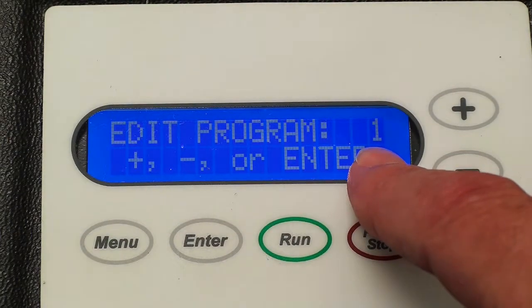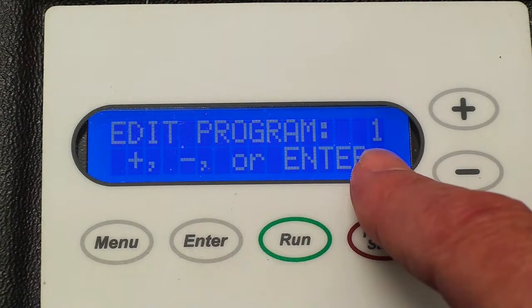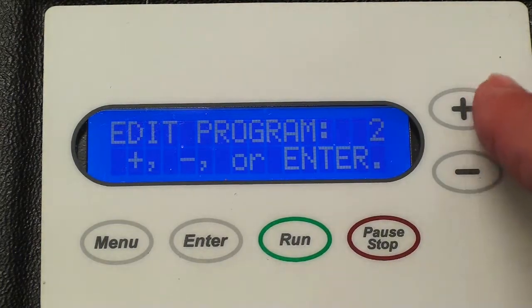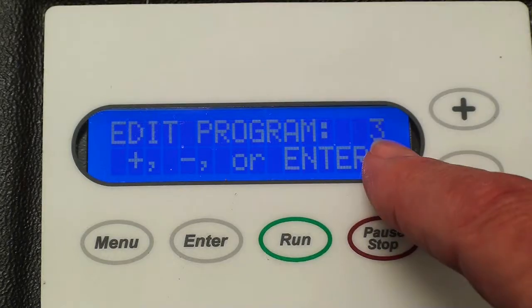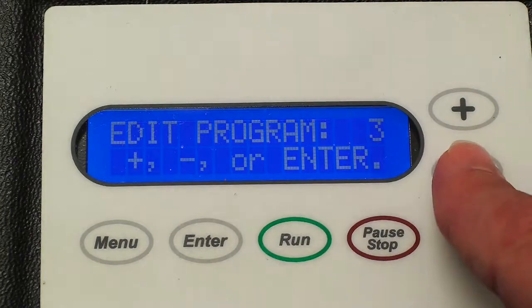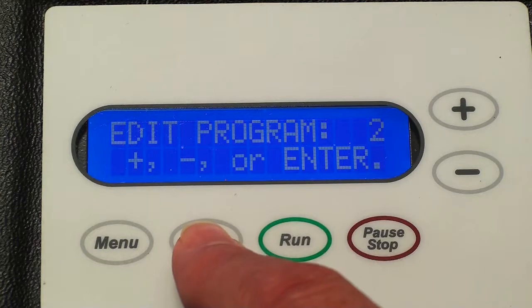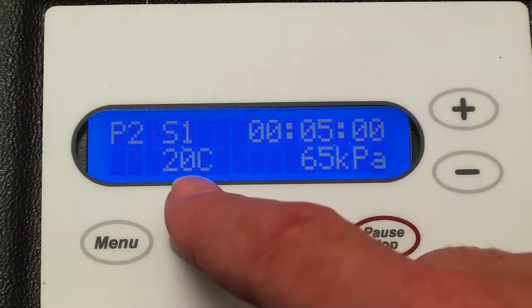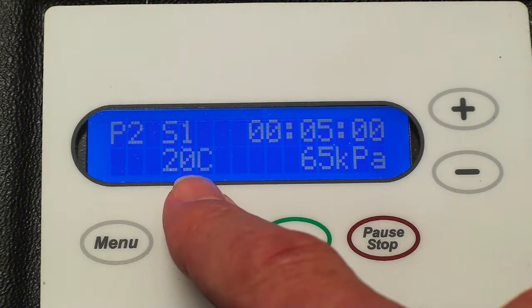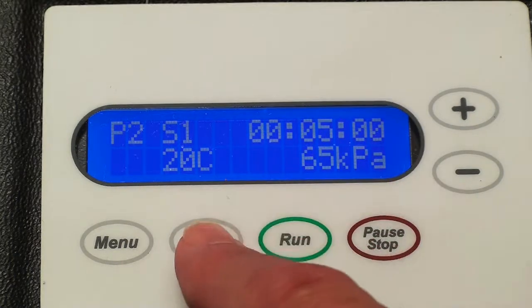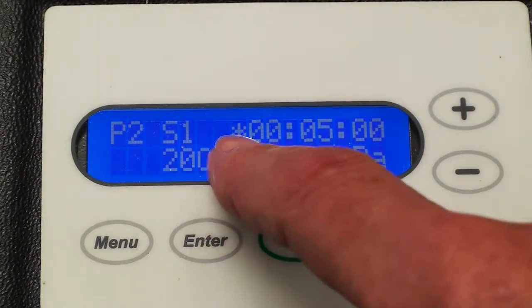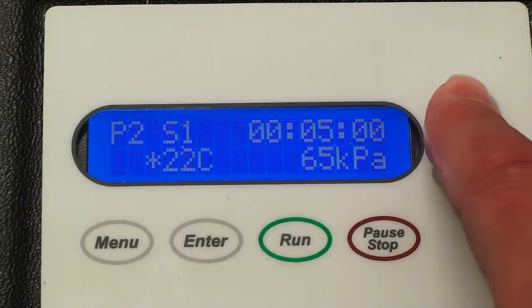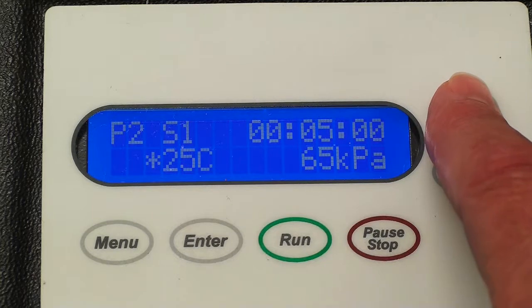It comes with programs number 1 for ethanol. Then number 2 is generally for acetone. And then number 3 is for propylene oxide. I'm going to be doing number 2 even though I'm running acetonitrile, which is more like an alcohol. And it has both a time and temperature that can be changed and also the vacuum. In order to change things, I can push enter and we can see the asterisk there. And I want to go to 25 degrees centigrade.